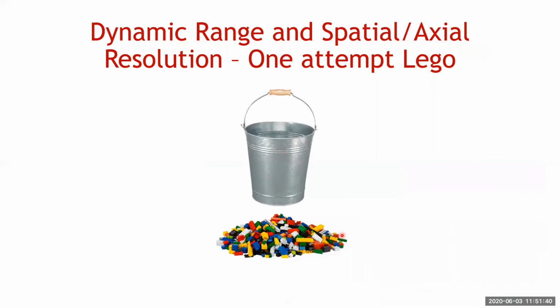So an analogy I decided to use for dynamic range and for the resolution is one-attempt Lego. Imagine you're given the task of building a giraffe out of Lego, and you have one go at it. We give you a bucket and a pile of Lego, and ask you to go away into another room and build it.